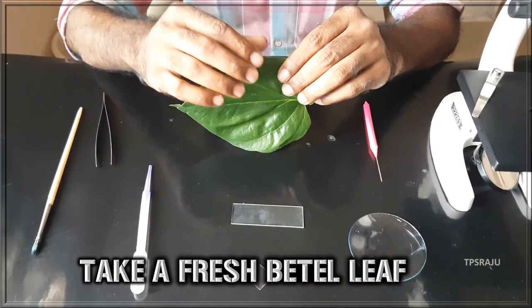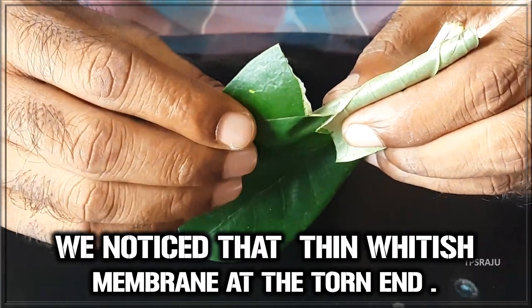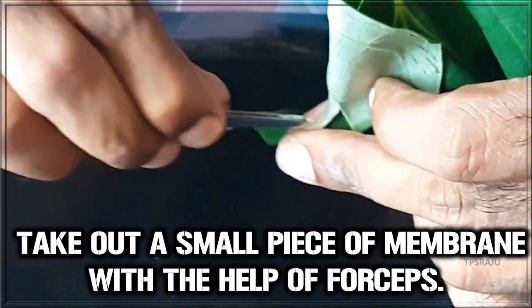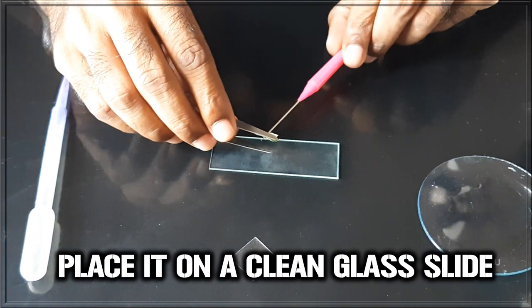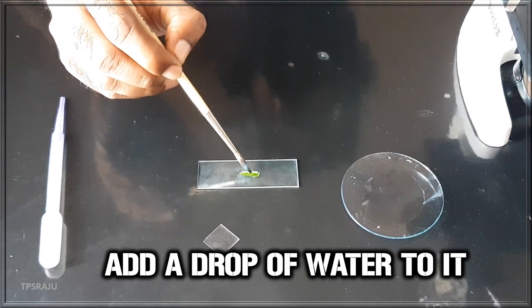First we have to take a fresh beetle leaf. Tear it in a single stroke. We notice that thin whitish membrane at the torn end. Take out a small piece of membrane with the help of forceps. Place it on a clean glass slide. Add a drop of water to it.